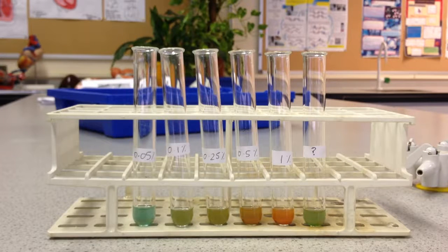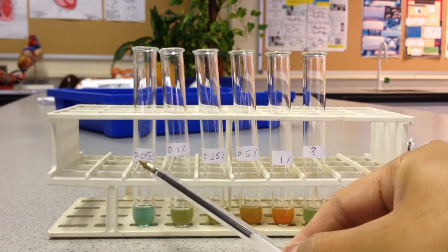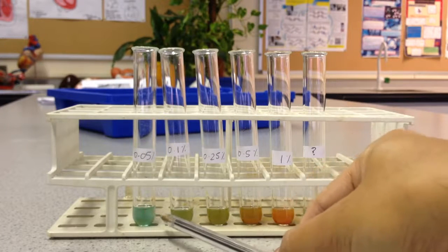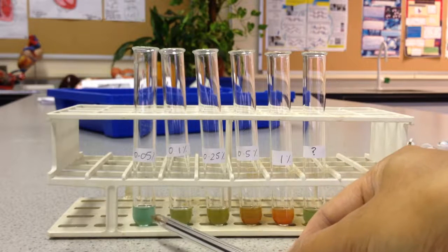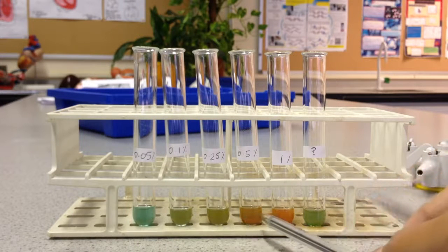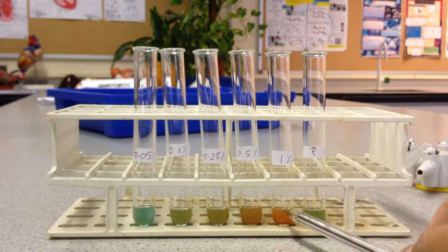So after about 5 minutes in the water bath, here we have the results of our experiment. As you can see, depending on the amount or the concentration of reducing sugar in our standard solutions, the reaction has gone further to completion. So the more reducing sugar you have, the more the copper has reacted to form the copper oxide, and therefore the more color change you get as the percentage increases from 0.05% to 1%.